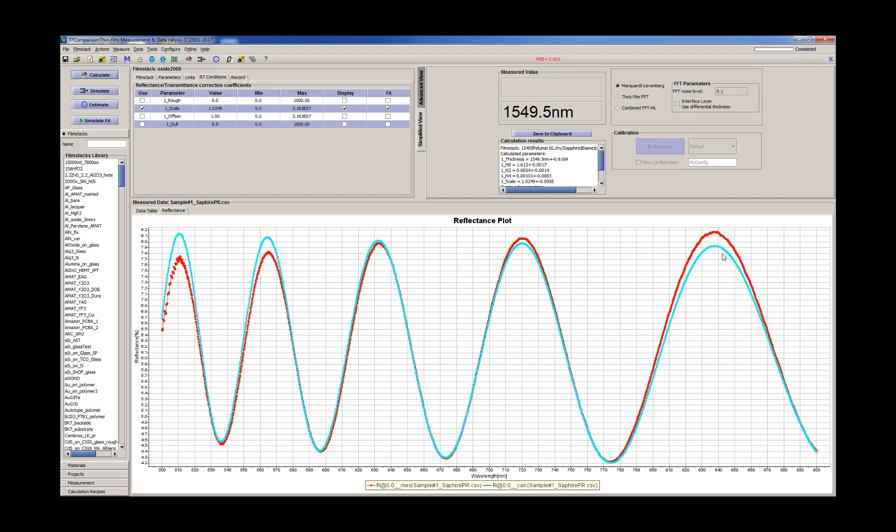So it looks like the effect of certain roughness, certain light scattering. It can be also some small absorption of the photoresist.